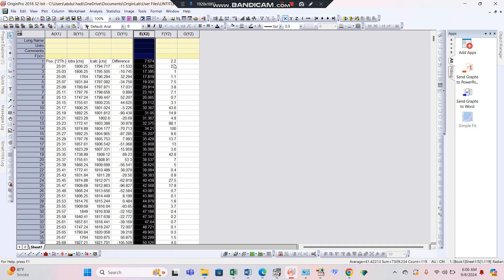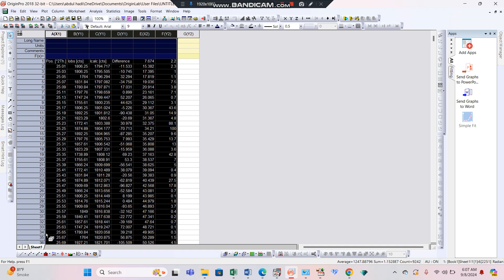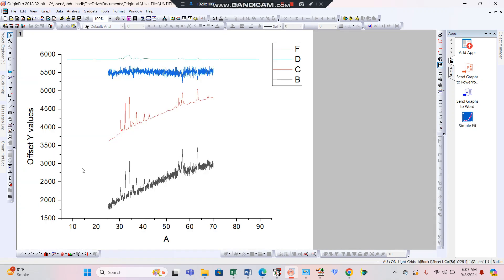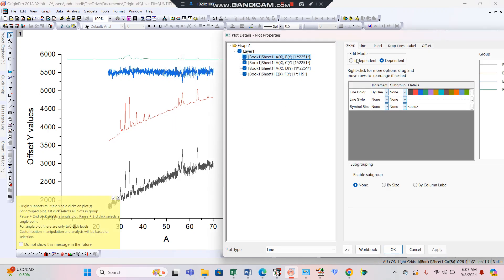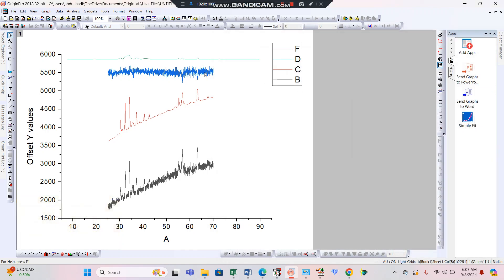This is 2-theta and this is intensity. To draw all this data, choose the stack line by offset option. Here you can see I-observed, I-calculated, the difference, and the JCPD card. First, press independent and then press OK. By clicking independence, we can now deal with each graph independently and move it to any position we want.